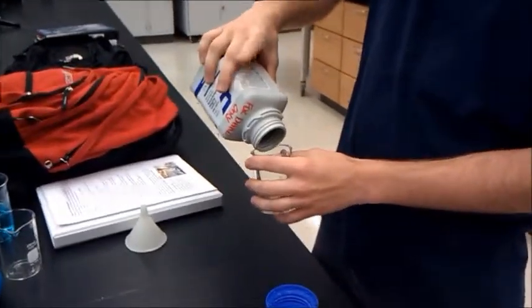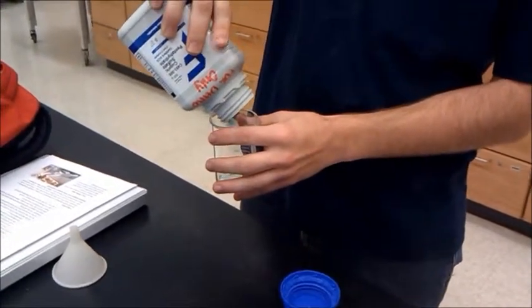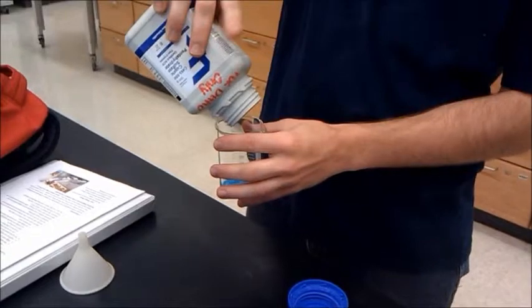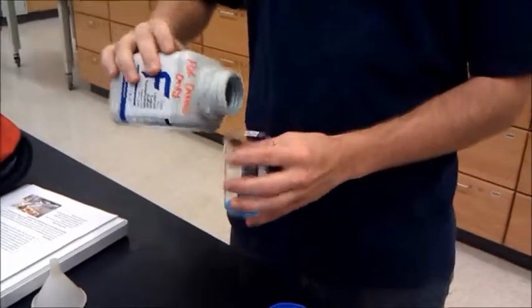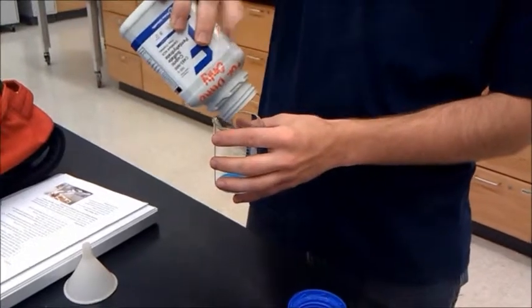First off, it's important that when using solids that come from a stock, you separate it from the main container by pouring it into a beaker. This helps to avoid any contamination of the solid.